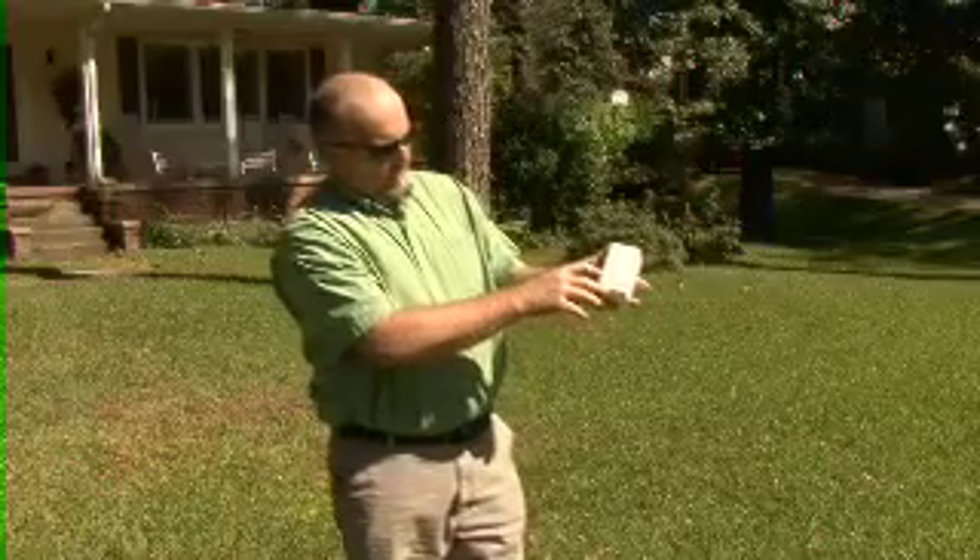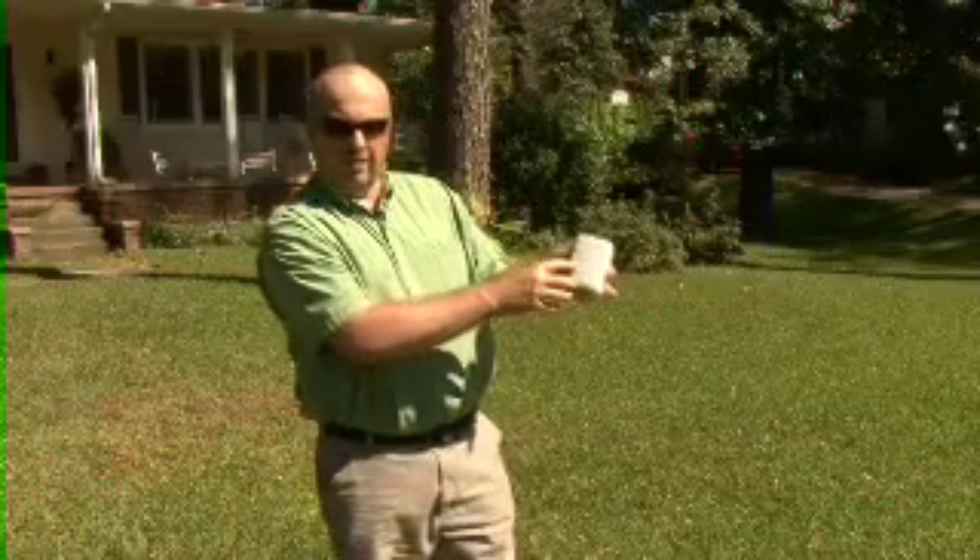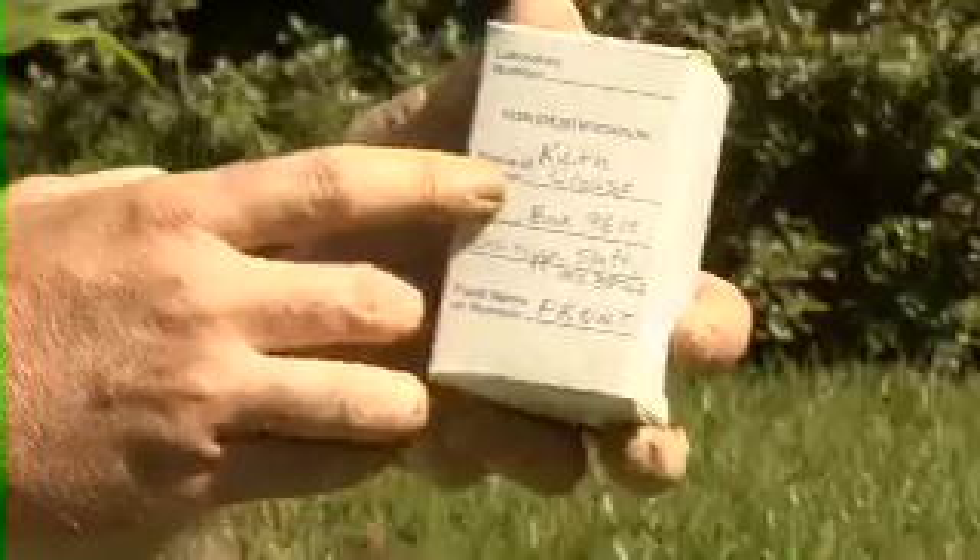You'd also want to make sure that you fill the box out with the information: your name and your address, and then the field number or field identification. We're taking a lawn sample today, so this is the front lawn — that is the reason why I chose 'front' as my field identification.